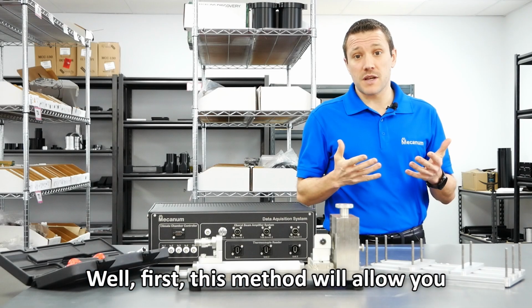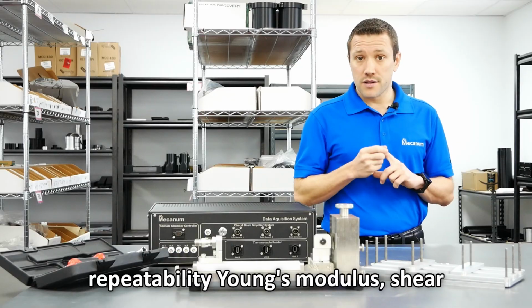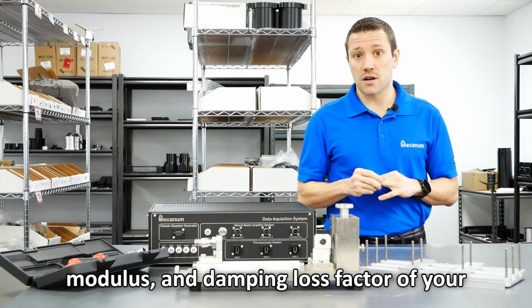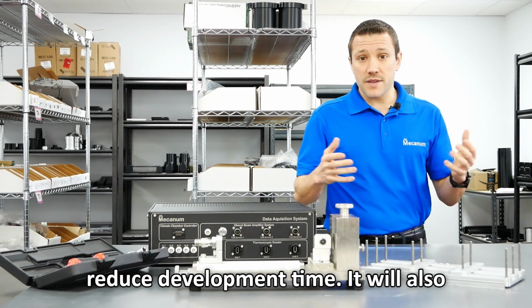Well, first, this method will allow you to measure with accuracy and repeatability Young's modulus, shear modulus, and damping loss factor of your viscoelastic material. It will help reduce development time.